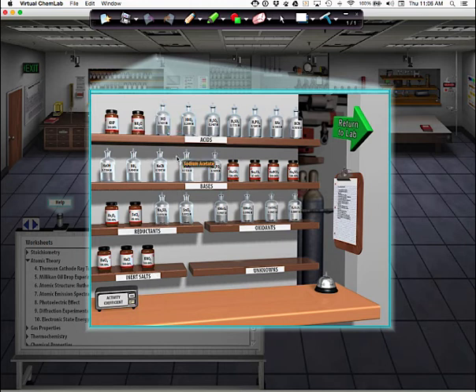But guys, watch how this works. So here's the hydrochloric acid, right? And you can see my mouse. When I put the mouse over the bottle, it turns into a hand, and that obviously means you can grab it. But guys, now watch down here on the counter. When I put the mouse over the bottle, watch what happens on the counter.